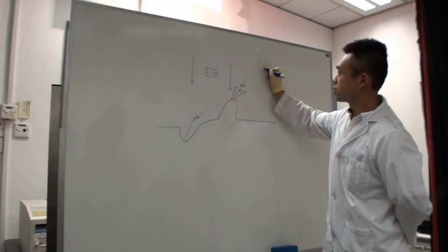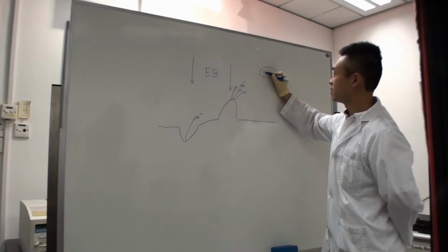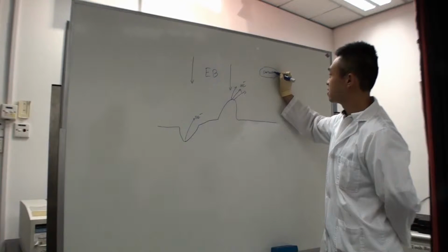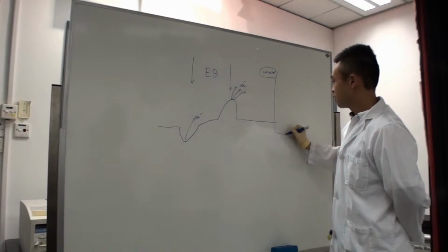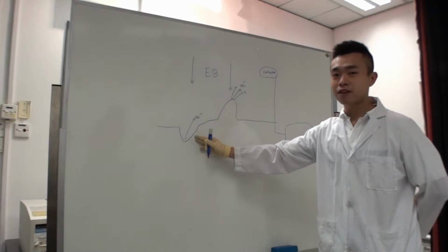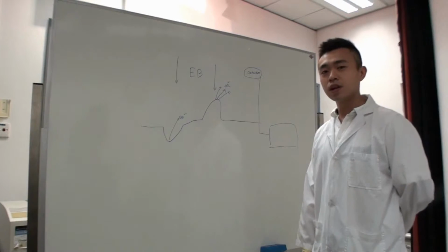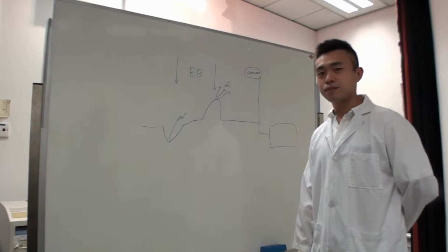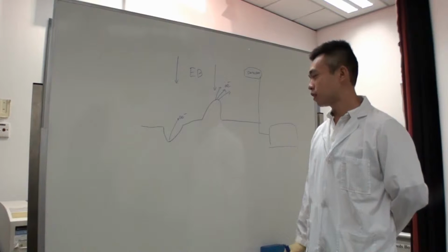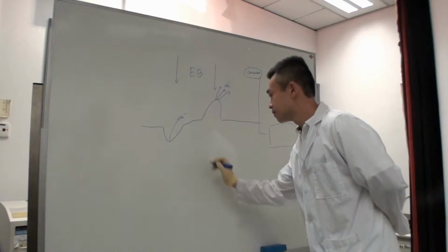After these signals are collected by the detector and shown on the screen, the lower part will have a darker color and the higher part will have a brighter color. So we can use this property of secondary electrons to detect the morphology of the specimen.